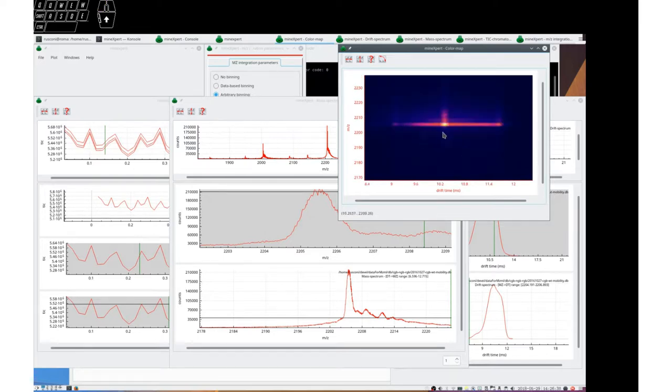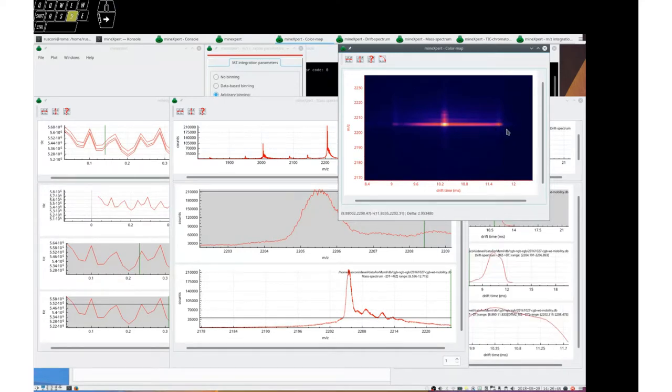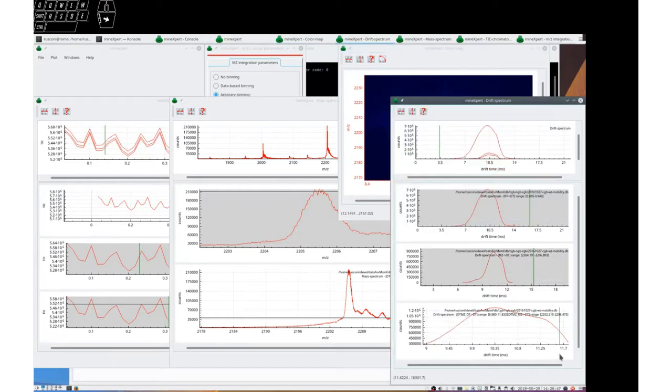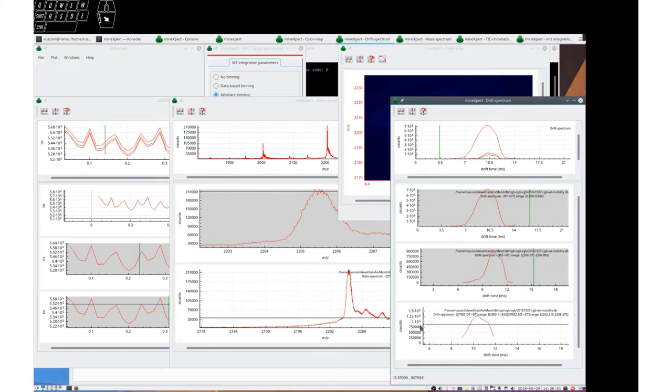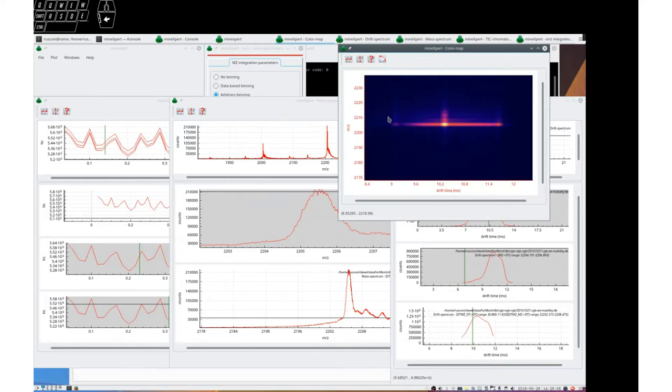Let's integrate, for example, to a drift spectrum for these species here. And this is the drift spectrum that we got. You see that it is really limited to roughly 9 to 12 because we started here roughly at 9 and we ended here roughly at 12.